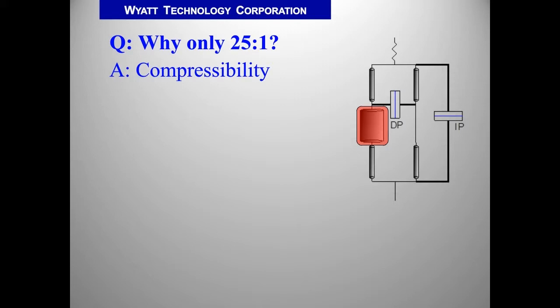Now, what we realized is that it's fairly straightforward to balance this compressibility by adding another element to the 4 capillary bridge viscometer. And that's what we call a compensation volume. And it's in line with the pressure transducer, but it's not in the path of the sample. The sample goes through the 4 small capillaries, but it doesn't go through the compensation volume. But the compensation volume does act like a spring that has compressibility, that balances the compressibility in the delay reservoirs, and that really gives you a much better ability to cancel pump pulses.